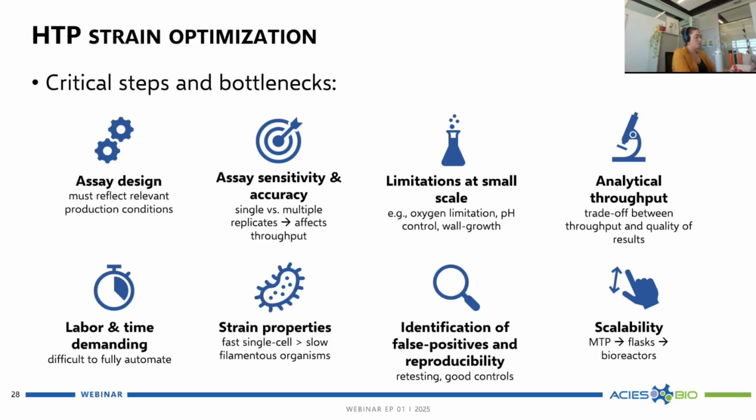Also, the sensitivity of the actual assay is important because this dictates how much of a difference you will be able to detect. Sometimes the technology is already really well developed and you're not looking for several factors of improvement, but maybe only 10%. And of course, this means that your assay needs to be able to see this. So you need a good resolution, where, again, very good analytics is important.